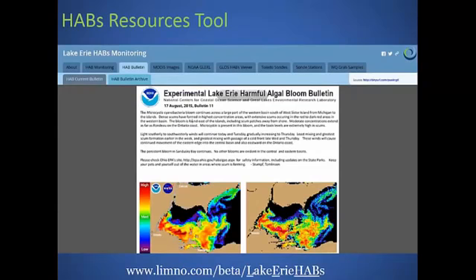One note I also wanted to mention is there's more than just the sonde data that's happening. Brenda mentioned the other sources of information that might be used by operators, whether it be a NOAA-issued HAB bulletin, MODIS satellite images, data from other researchers. So one thing we worked to set up this year was an all-in-one website, more of a tabbed website that links directly to other agencies' data sites. So we can share with this one link the NOAA HAB bulletin, our sonde monitoring data, the MODIS images.